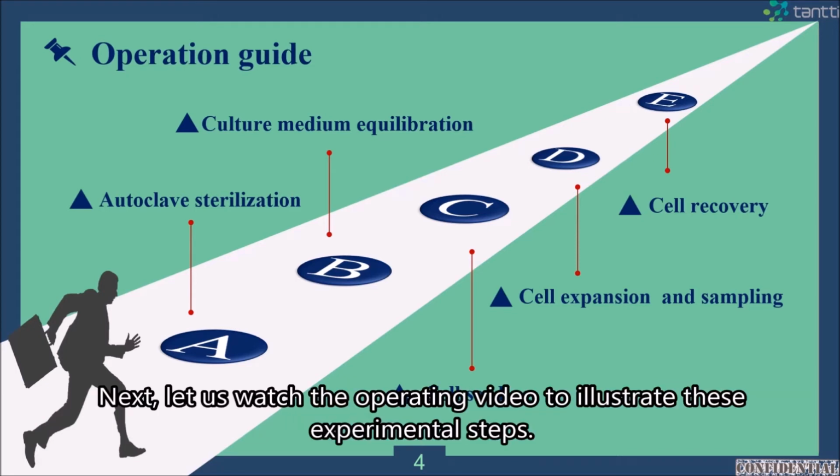Next, let us watch the operating video to illustrate these experimental steps.